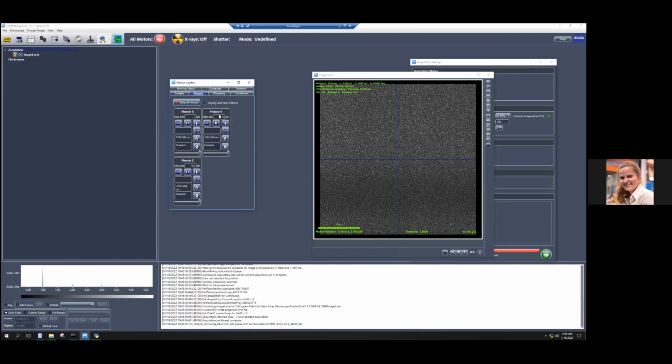What's the lower limit on how far you can move? Like 0.1 micron or? Oh, our motors aren't that good, so none of the motors move reliably below a micron. It's a 40 micron pinhole, so 2 microns will probably be just the perfect amount.